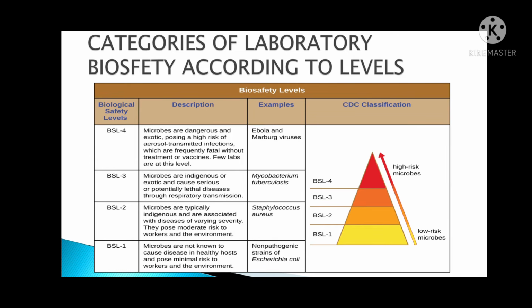All laboratory activities are required to be performed in a biosafety cabinet or other containment equipment like a gas-tight aerosol generation chamber. Secondary barriers for this level are highly required, including controlled access to the laboratory and ventilation requirements to minimize the release of infectious aerosols from the laboratory, while special engineering and design features are also considered. Personnel must be supervised by scientists competent in handling infectious agents and associated procedures in a BSL-3 laboratory.